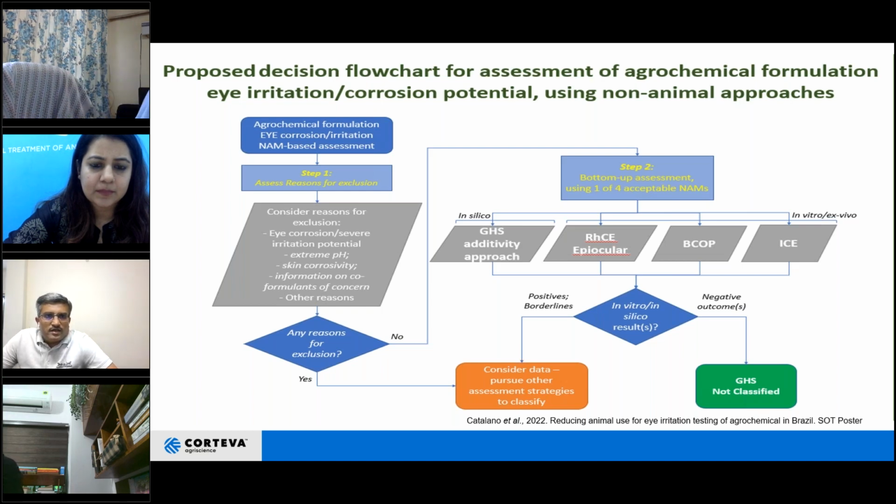These reasons can be physicochemical properties or historical data, eye corrosion or severe irritation potential, extreme pH, skin corrosivity, which gives a good correlation for either positive or negative effects, information on co-formulants of concern, or any other reasons.